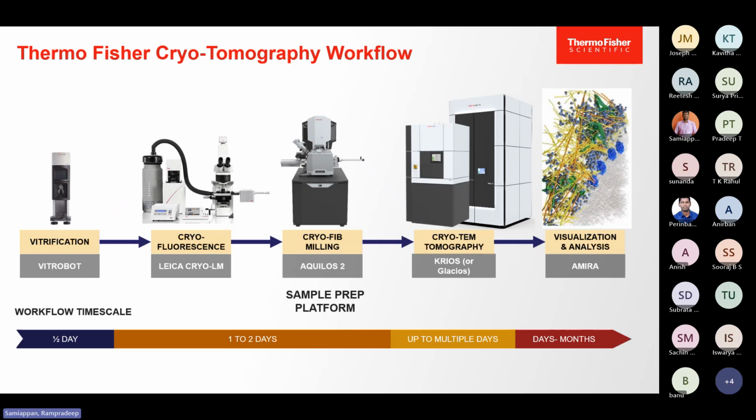This is the common workflow of the tomography process, and we use Amira software, which is in-house software, for classifying the particles. And this is the time scale in which we can expect to see the results. Even before that, there is a lot of research work. The time-consuming process is the sample optimization. Once that is done, it might take days or even months.